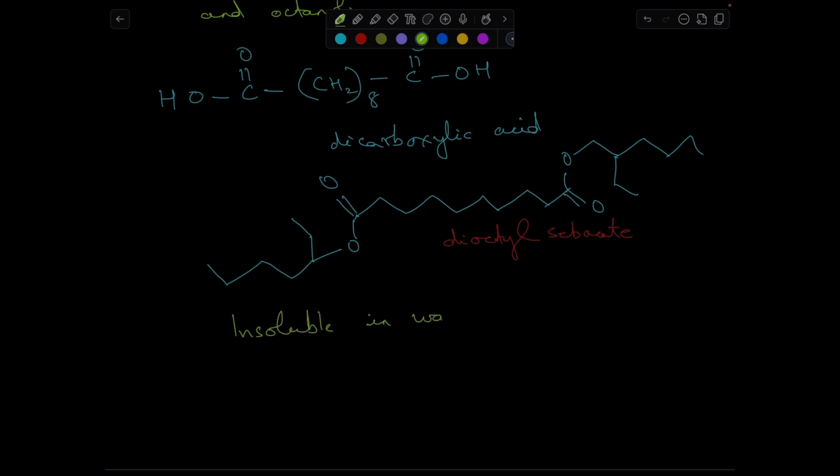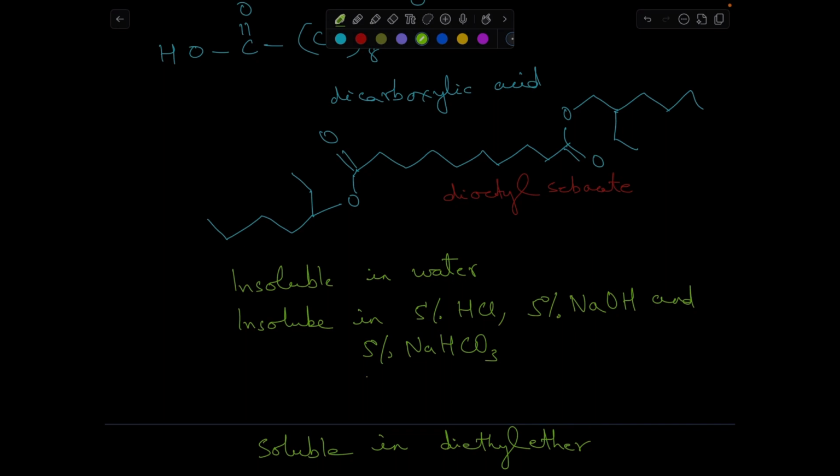And because it's an ester group, there is less reason to react with 5% HCl or 5% sodium hydroxide or 5% sodium bicarbonate. So it's insoluble in 5% HCl, 5% NaOH, and 5% NaHCO3 as well. And this ester is soluble in diethyl ether.